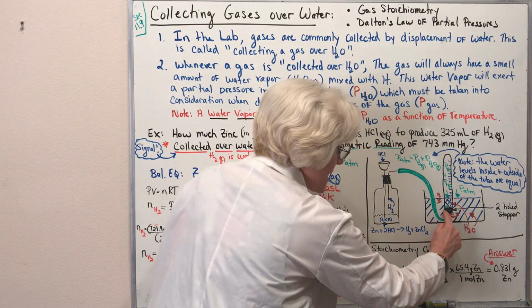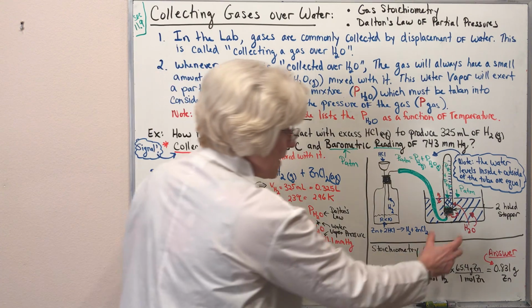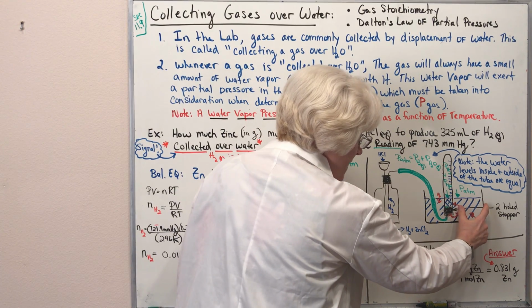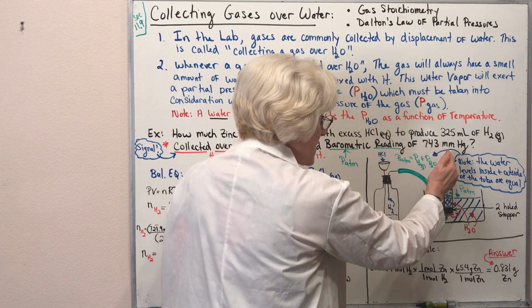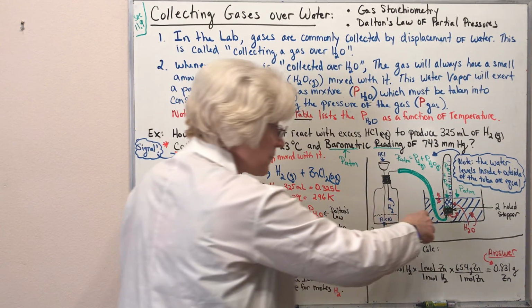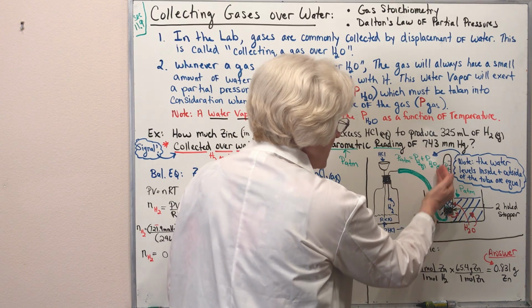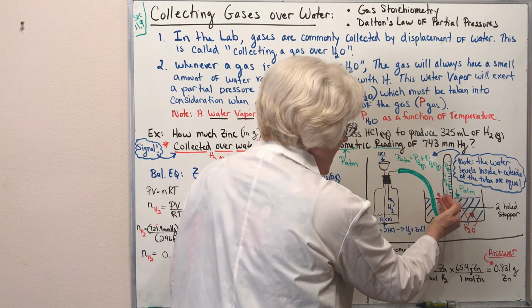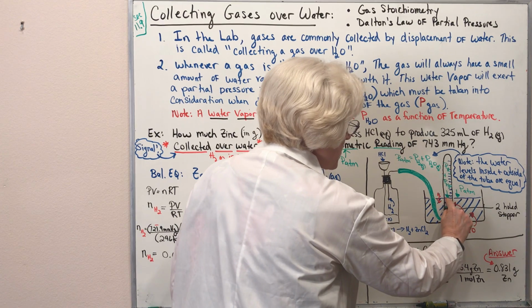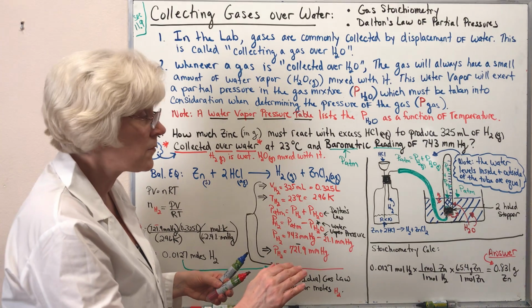And of course, as I said, water can flow back and forth here. So you have water present in the dish pan and water present in the tube, and they are in continuous flow with each other. So at the end of the experiment, you lower the gas measuring tube so that the water levels inside and outside are equal.